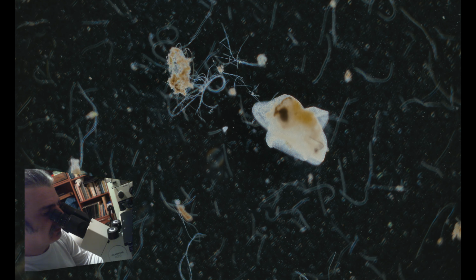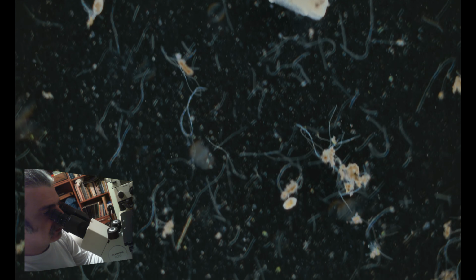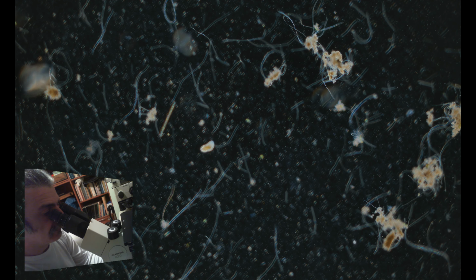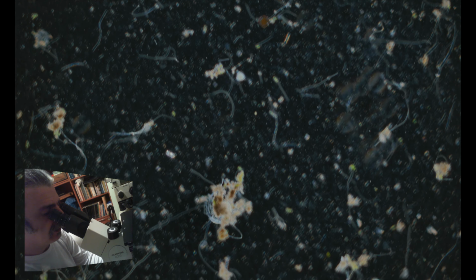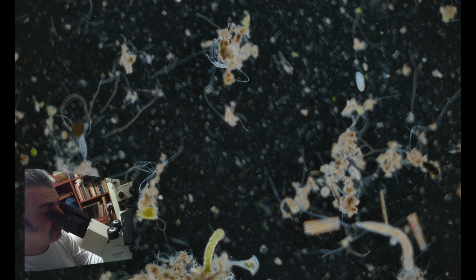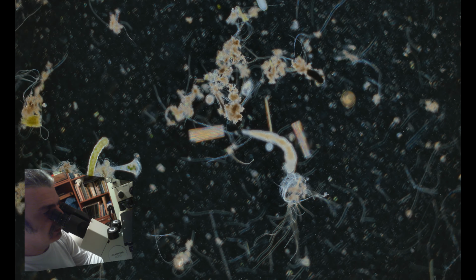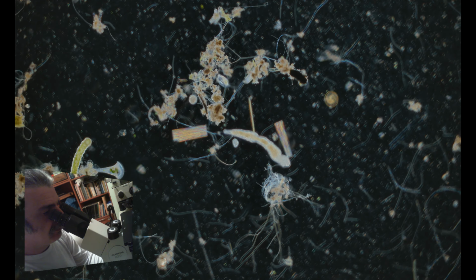Mesodinium, I suppose, a ciliate. Here's another ciliate, I don't know who it is at the moment. But it's good to create this map so we can go back to those creatures later in great detail.